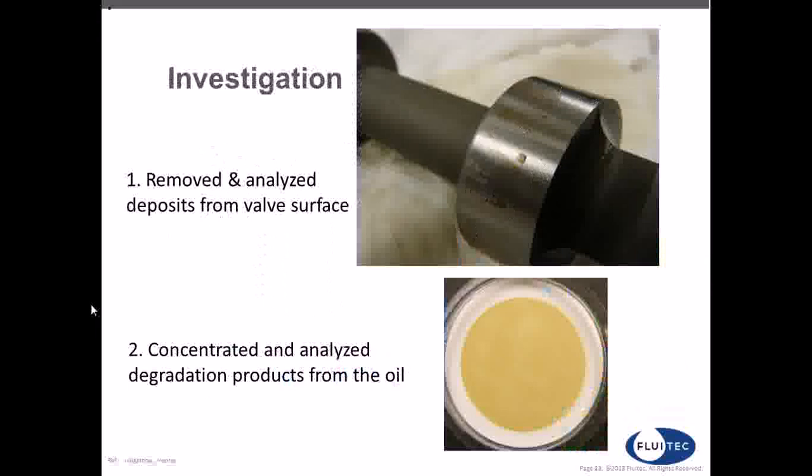And the other thing is the membrane patch colorimetry test, although it was only a 16, we were able to concentrate a lot of these deposits out of the oil to see if we could identify the same chemistry in the oil that was on this valve block. Typically, the MPC test is run by putting 50 milliliters of oil with 50 milliliters of solvent. In this particular case, we put several hundred milliliters through this patch to capture as much material as possible to analyze.